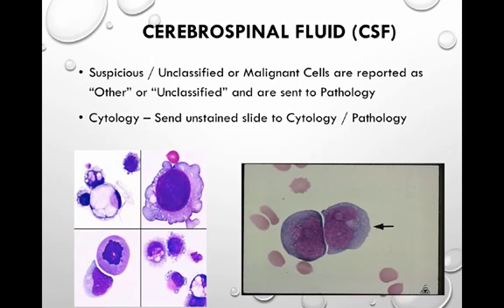The cells in this and the next slides are examples of what we call suspicious or malignant cells, as sometimes seen in cerebrospinal fluid samples. This is not designed to give you the knowledge and skills of a cytologist; however, the MLT should be expected to recognize abnormal cells that do not fit the pattern or characteristics of our normal white blood cells and ependymal cells.